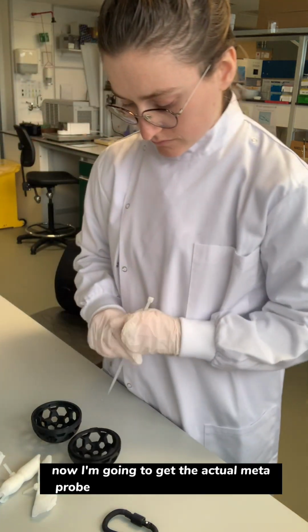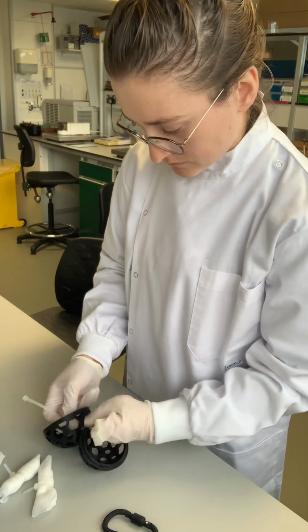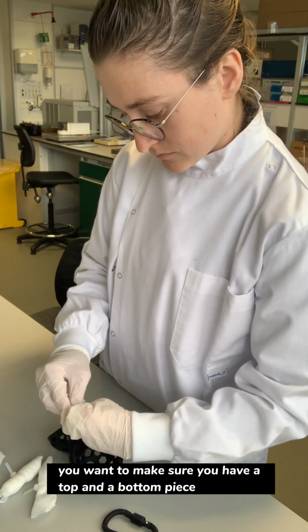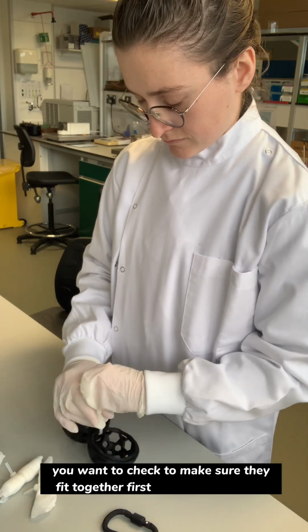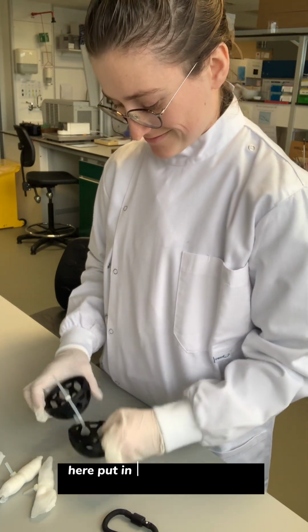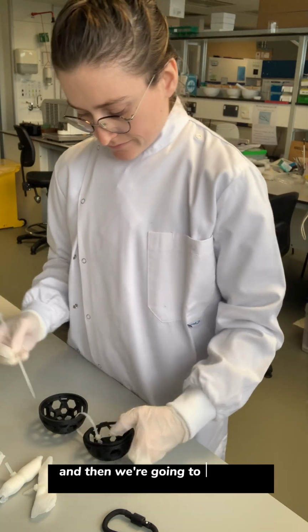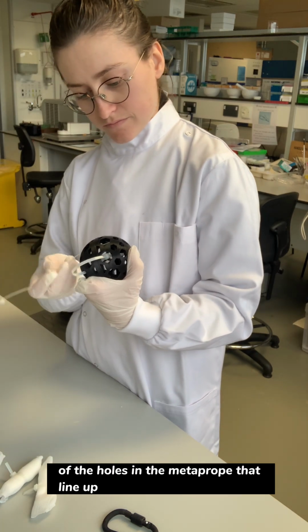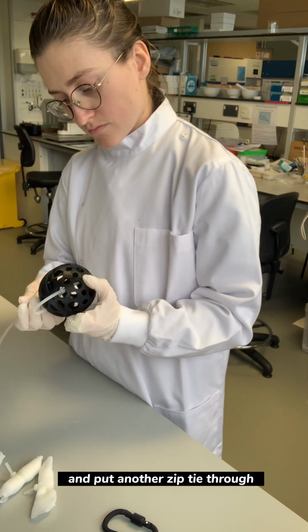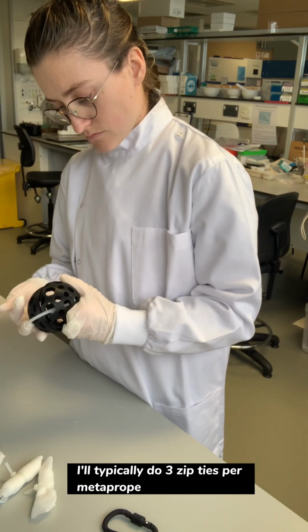Now I'm going to get the actual Metaprobe, and we put the Metaprobe together using zip ties again. You want to make sure you have a top and a bottom piece. You want to check to make sure they fit together first, and then we're just going to put in the first zip tie very loosely, and then we're going to go in and find some more of the holes in the Metaprobe that line up and put another zip tie through. I'll typically do 3 zip ties per Metaprobe to hold it together.